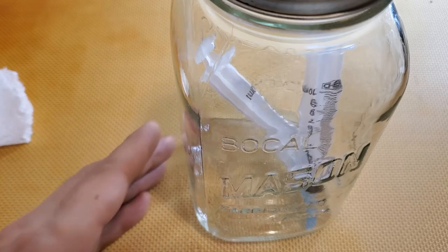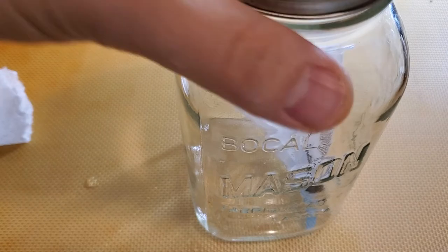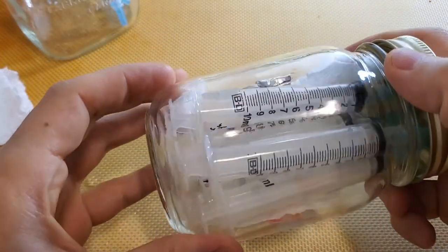After that, they should be 100% sterile and ready to go for any application you desire. Here is a jar that I have recently done, and all these syringes are sterilized and ready to go.